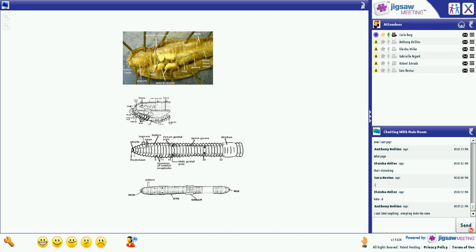The next thing, which you should be able to find, Anthony, is the intestine. The intestine is what is running down the entire center of your worm. So if your mouth is not that clear, move down towards where you started. You are dissecting. Use your probe and look around there. That is the intestine. All right, I assumed the intestine we would all find.